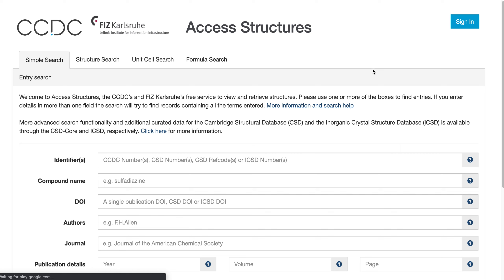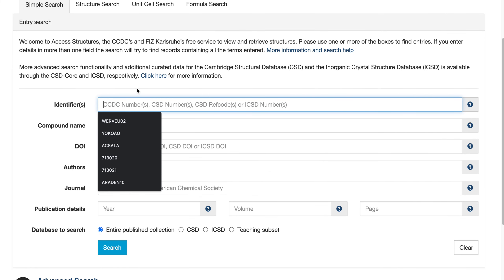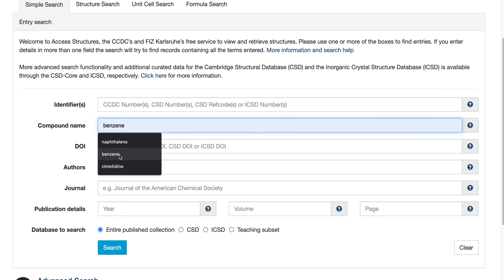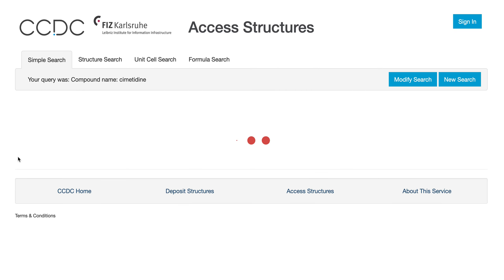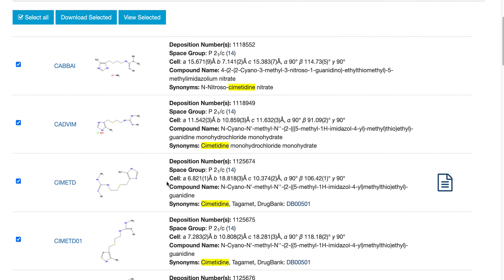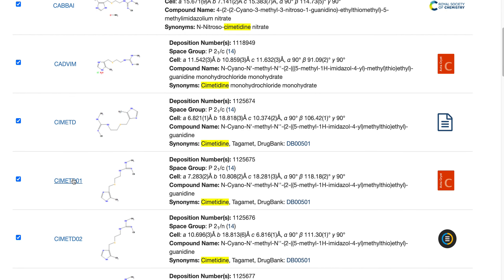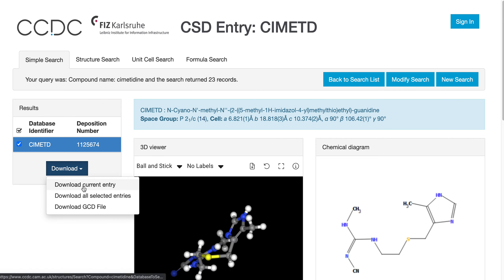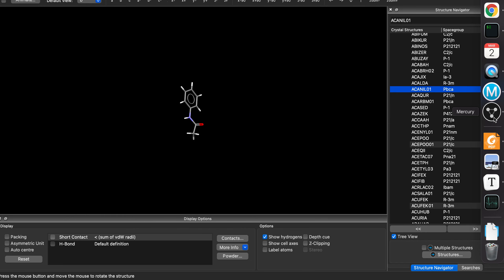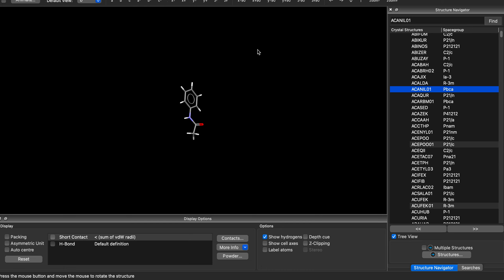I will also include this link in the video description, so you can search by user identifier or compound name. Let's say we search for cimetidine — it will show you all the matches. You can see this is cimetidine; cimetidine 01 and 02 might be the same structure or might be polymorphs. You can click one of them and then download the .cif file, which you can then import into Mercury.